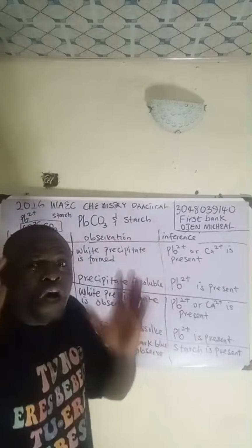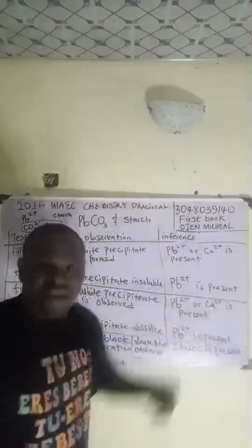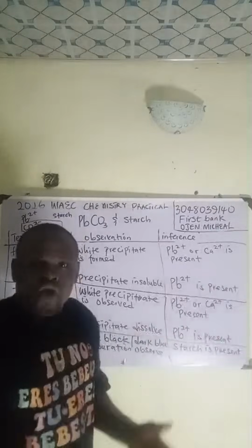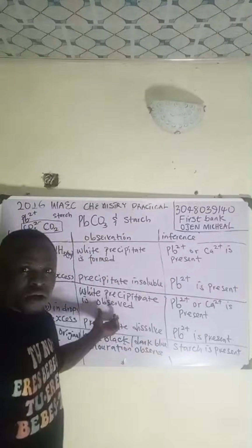That is if they only ask you to add potassium iodide. But it is not in the instruction material. The reagent listed for you to use and do the test, it is not there. If we had it in the instruction, we would have added it here.